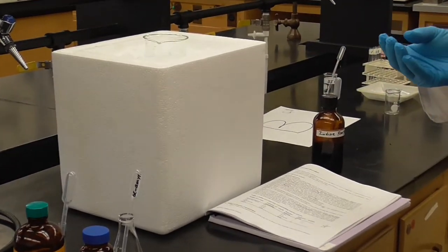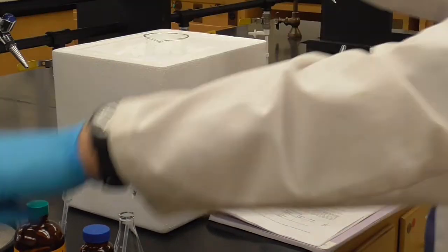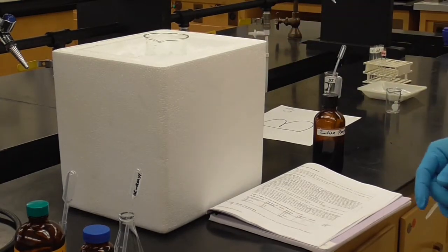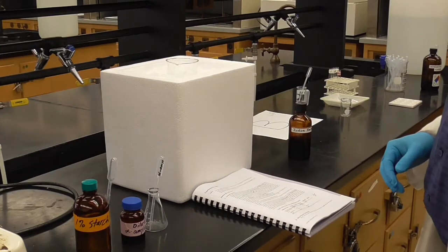Most of this lab we're going to do in the 37-degree one to mimic the human body. But we are going to want to investigate these two, the hot and the cold one, as well, to see how that might affect the enzyme's ability to work.